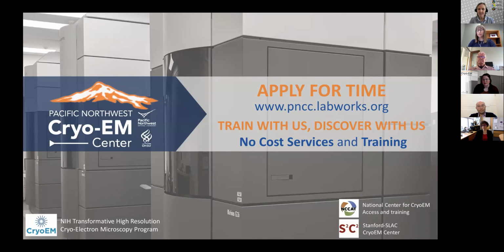At PNCC, we have a monthly submission deadline for our applications, and for each approved proposal, we delegate a SPOC, which we refer to as a scientific point of contact, to answer scientific questions. We currently have 5 scopes. We have 1 Arctica with K3 upgraded to fringe-free, and an Arctica with Falcon 3, K3, and fringe-free as well. 2 Krioses with Falcon 3, BioQuantum, K3, and 1 Krios with Falcon 4, BioContinuum, K3, also fringe-free.